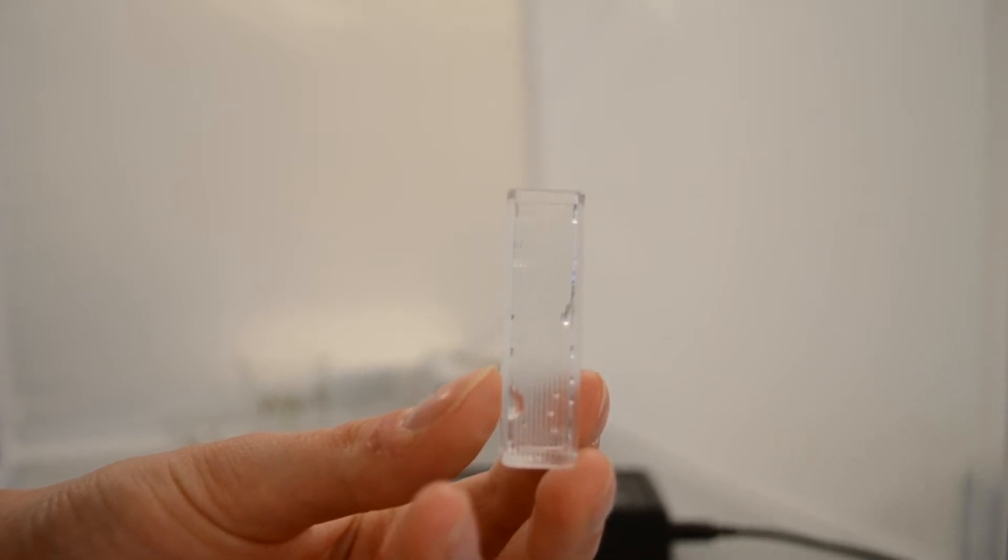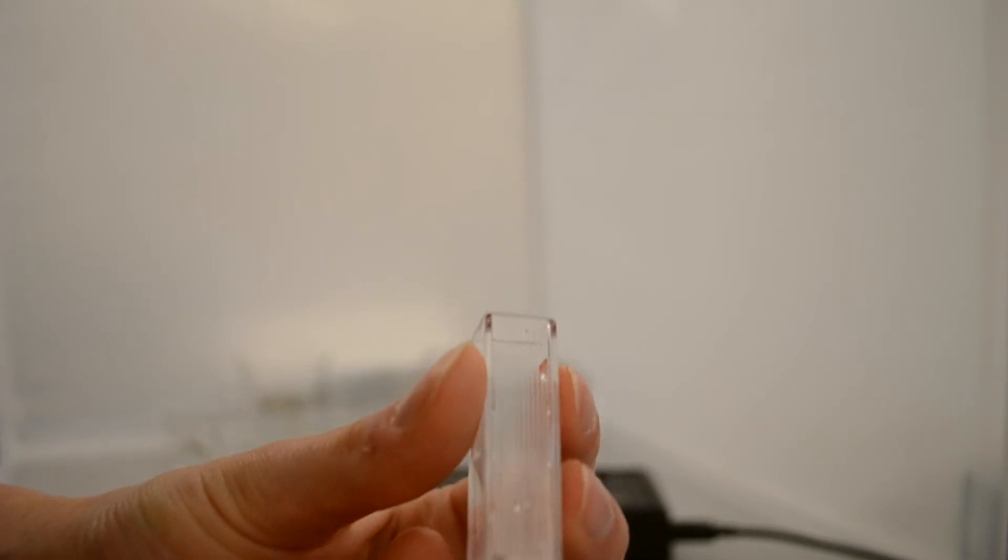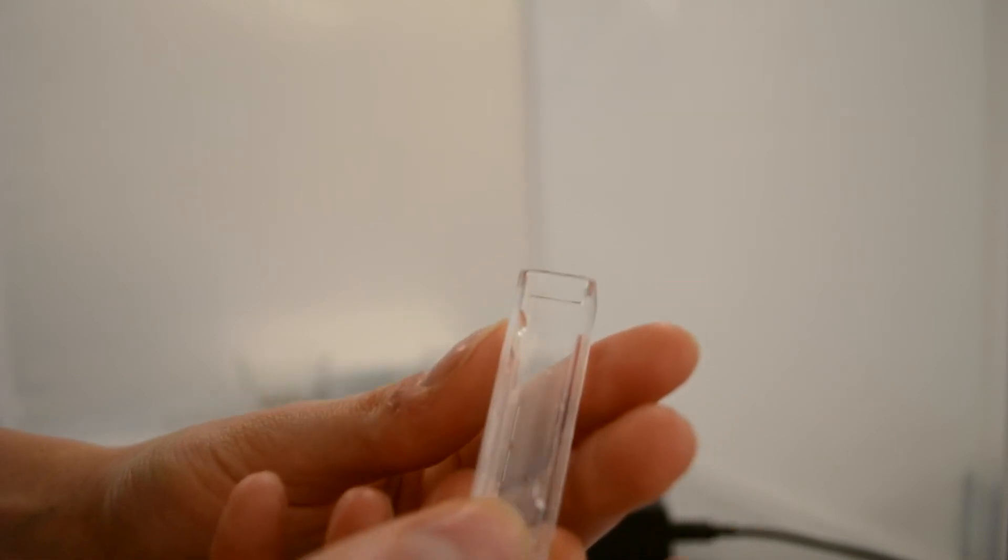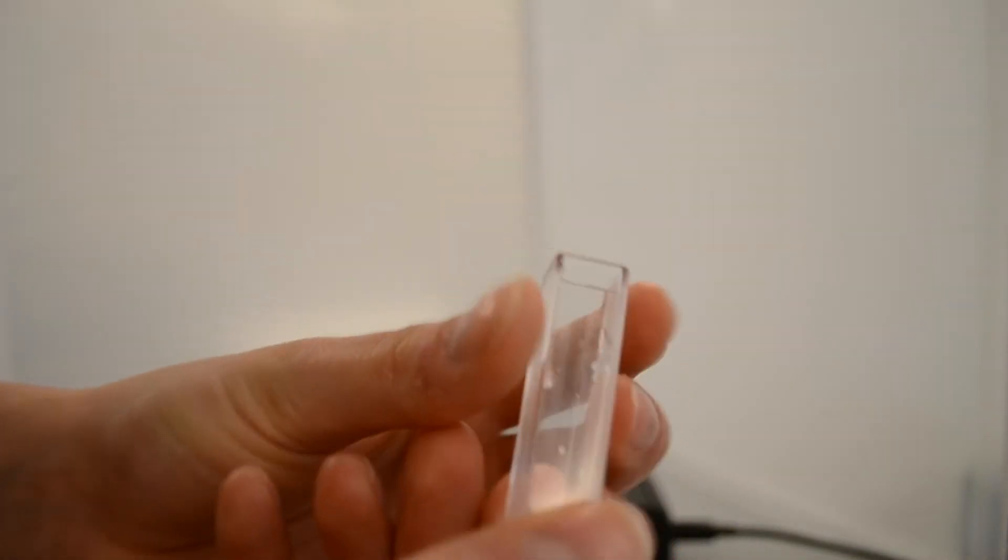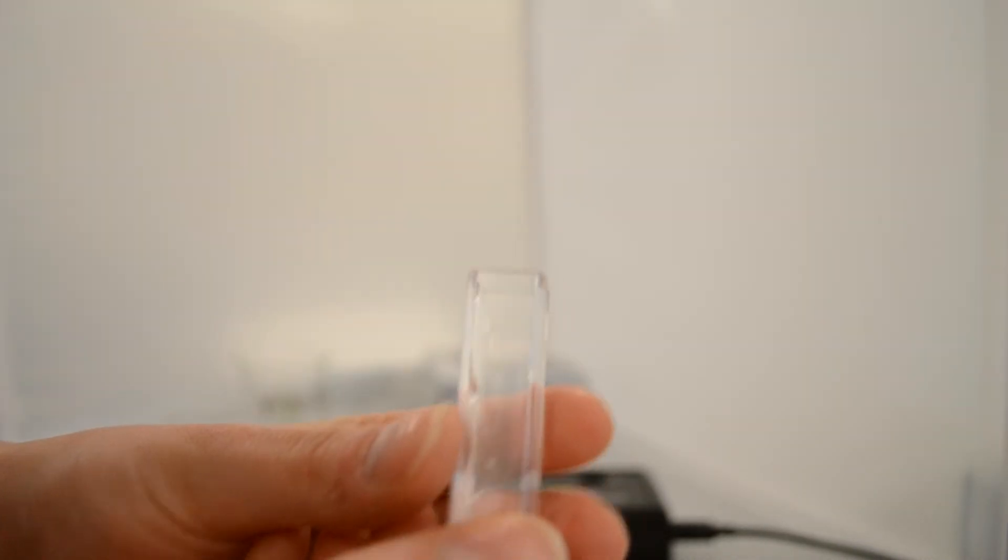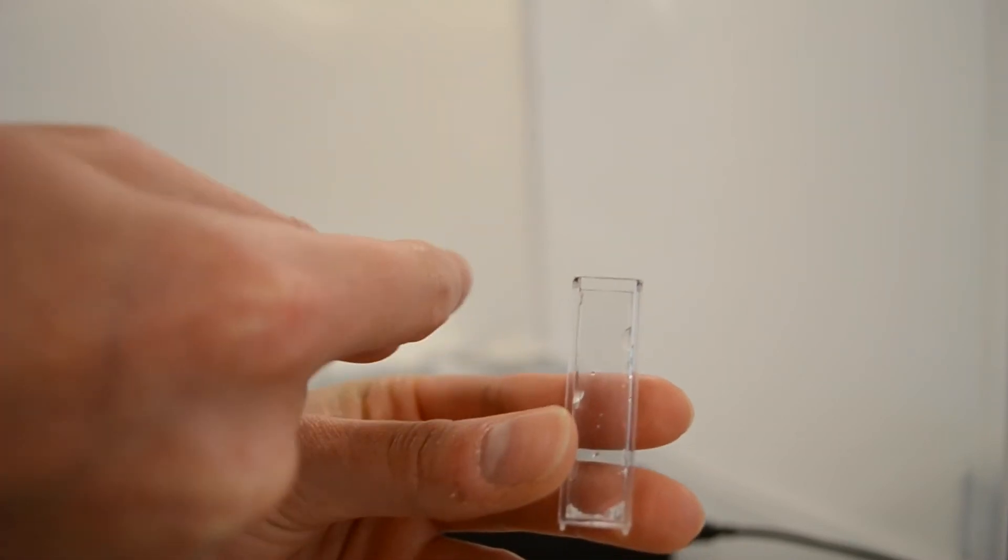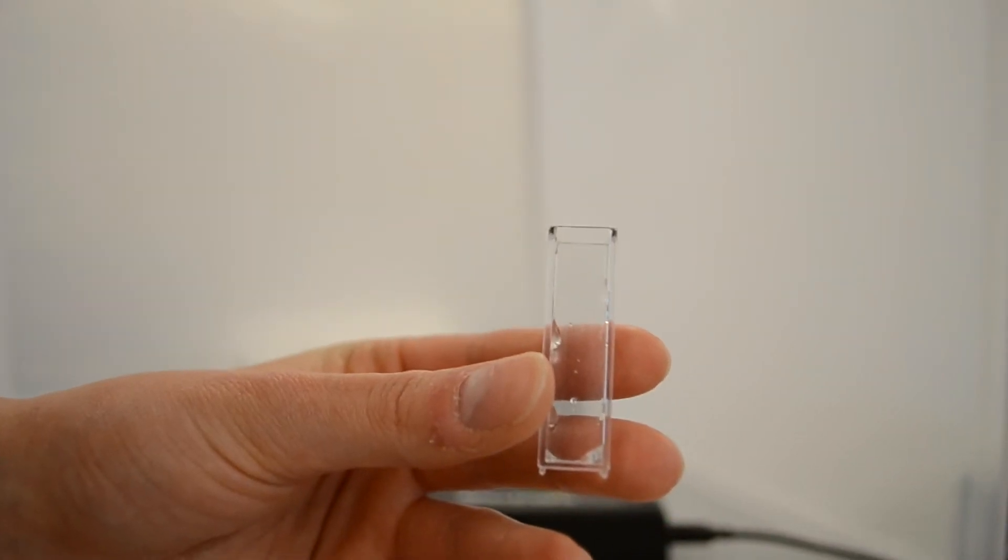The cuvettes have two frosted sides and two clear sides. The light has to run through the clear sides. The light in these specs run from the right to the left, so make sure to place the cuvette so that the clear sides are on the right and the left. If the light runs through the frosted sides, the data will be incorrect.